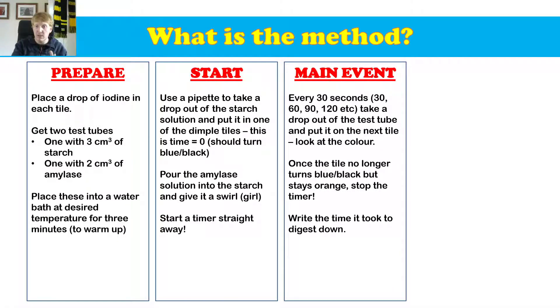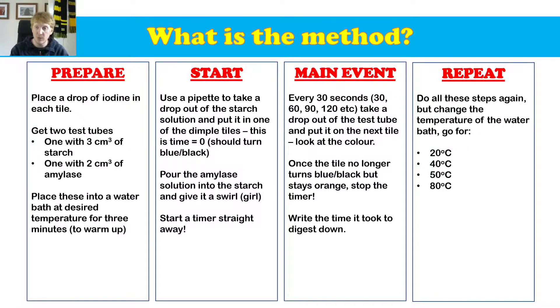Every 30 seconds, what's going to happen is we're going to take a drop out of that test tube, and we're going to pop it on the next dimple tile that we have. And we're going to look at the colour. Once the tile no longer turns blue-black and stays orange, we're going to stop the timer. That's the first part of the experiment done. We're going to write down the time it took to digest in our books.